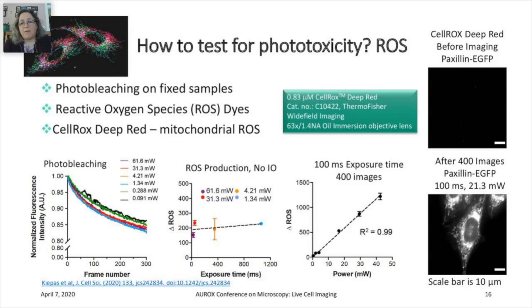So if you have this ability to go to more diffuse light delivery and use longer exposure times, you also still want to make sure that this process is not phototoxic to your sample. And there's a huge amount of literature out there on how to measure phototoxicity, and there's really nice examples with cell division, with small organisms. And I think the main thing we wanted to contribute here was giving people methods for measuring it a bit more quickly. So a lot of those methods, if you're looking at proliferation, you have to wait hours or days in order to make sure that the proliferation rates have not been affected. And the methods I'm going to mention here are ones that can be measured as an endpoint assay, or they can be sampled periodically throughout a live cell experiment.